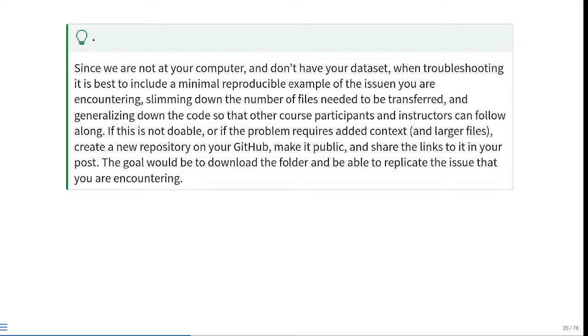If I need to look up an error or a warning, I'm generally not copying the entire thing into a Google search. I'll take the keywords from it, because Google is not going to be searching for your particular computer's file path or your particular package. I'll be looking for similar questions asked about different packages, different people's computers. So those are the elements that we should encourage.